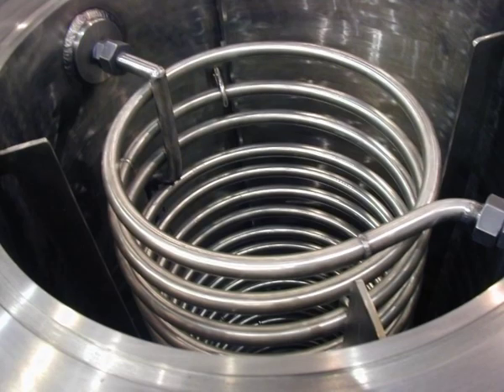The culture broth rises in the compartment enclosed by the cooling coils and it moves down in the compartment outside the coil, although back mixing also occurs through the coils. The region above the cooling coil shows good mixing and there were no poorly oxygenated zones in the vessel.